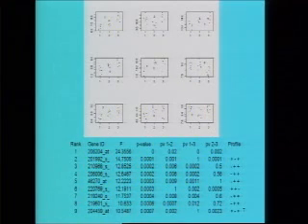So here is a table of top rank genes. We know the gene identity, so we know the annotation or identity of a gene which has this distinct profile. These are the F values, so these are the top ranked genes according to the one-way ANOVA F test. The p values are very small, so all these are significantly differentially expressed genes. The next column gives you the p value for testing mu1 equal to mu2. The next column is the p value corresponding to the pairwise test for mu1 equal to mu3, and the next one is mu2 equal to mu3.